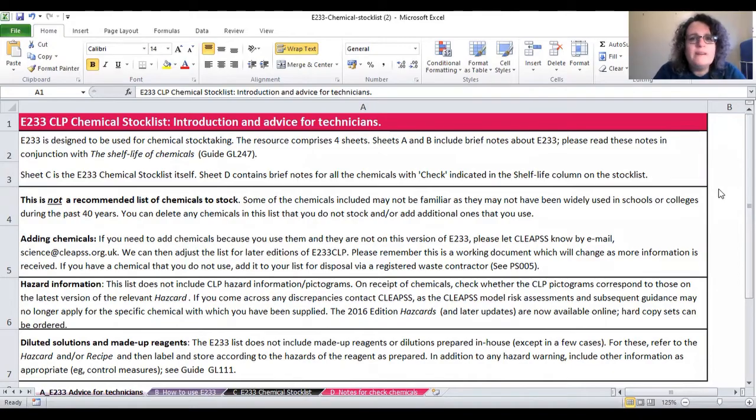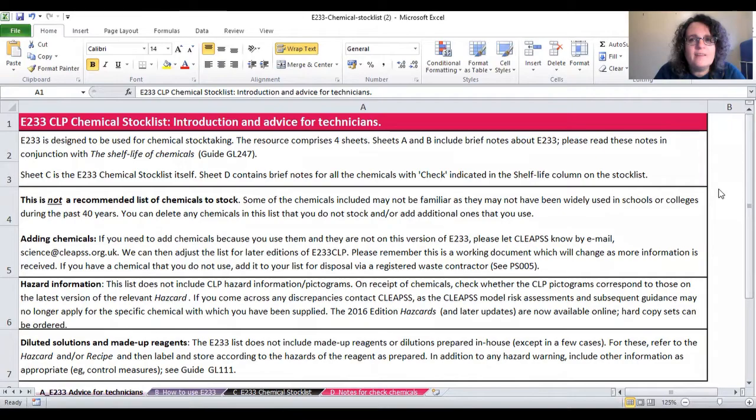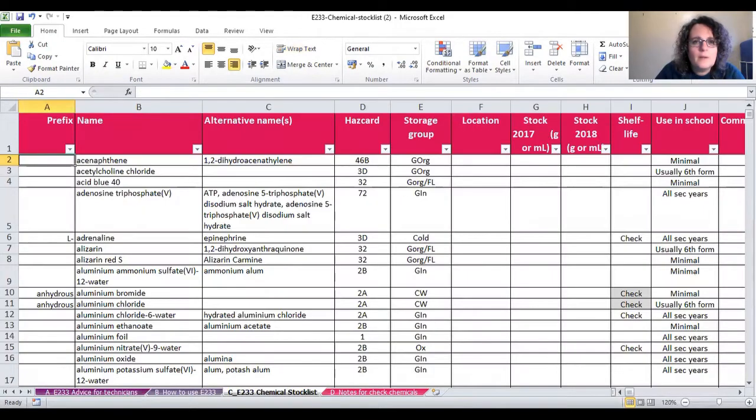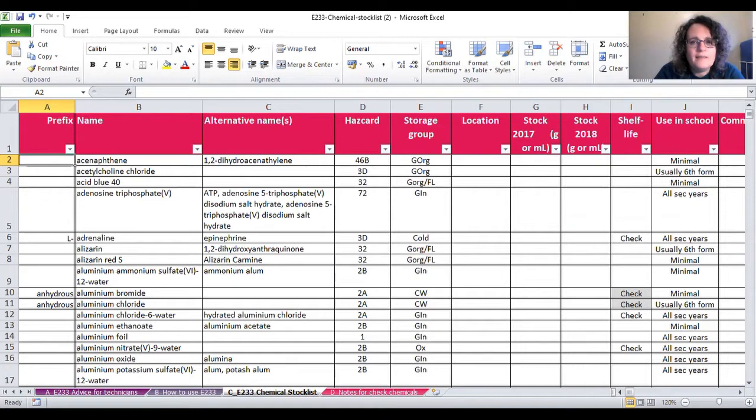If you already know about E233, the chemical stock list, which is an Excel spreadsheet that you can edit, you could use this as a basis for your chemical inventory. We've already done a lot of the work for you and have included the hazcard number and storage group.